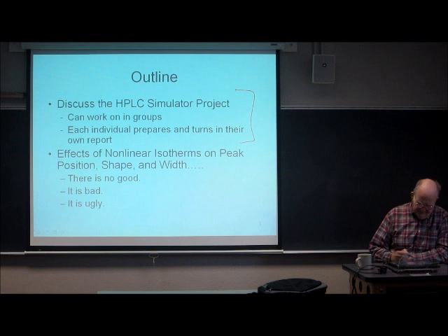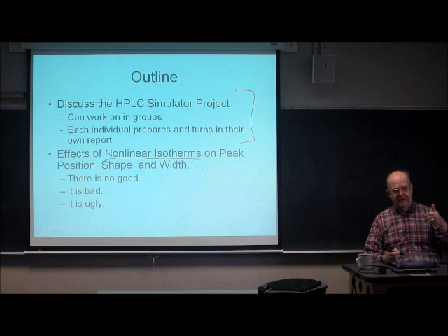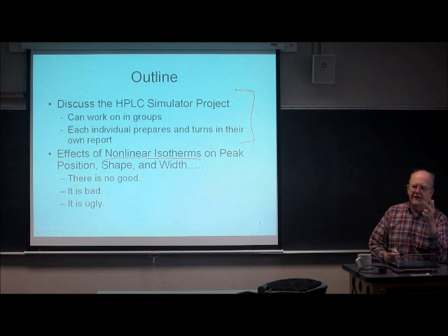But what we're going to talk about is the effect of nonlinear isotherms on the position of the peak, on the shape of the peak, and on the width of the peak. And there is nothing pleasant about this. There is no good. There's bad and there's ugly. This should be called How to Make an Ugly Peak.